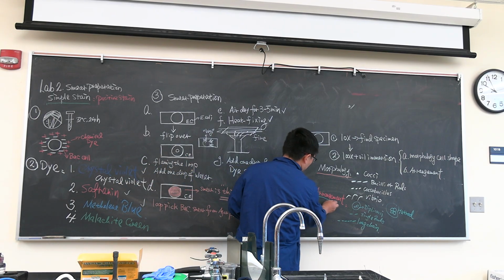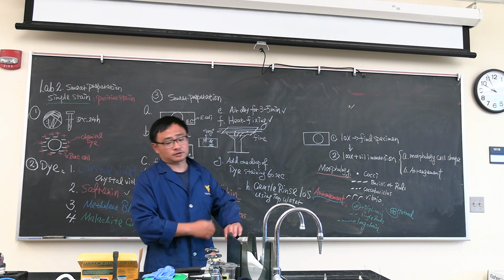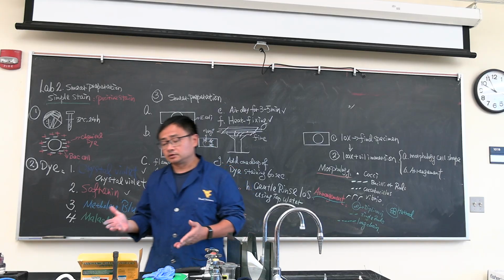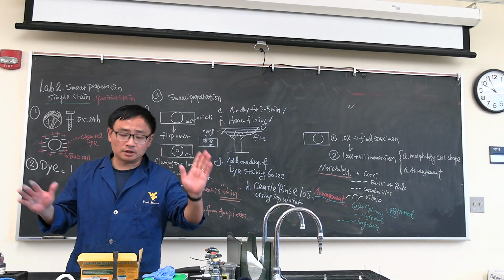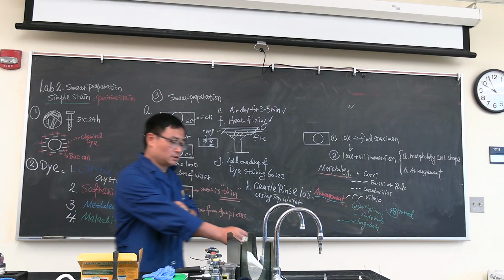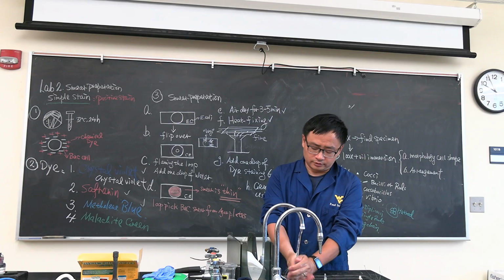This we can use in simple stain to do. The missing one is the gram results, that will be learned next week, Tuesday. So here are some of the examples. Then I'm going to go ahead and show you how to do it.